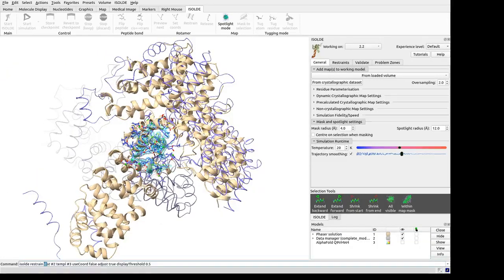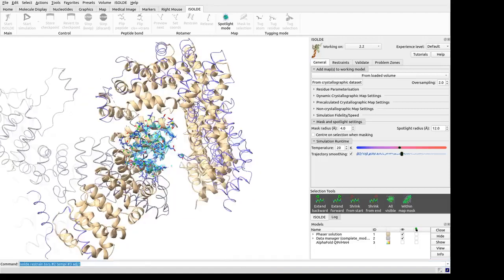In a similar manner, we then add restraints to all phi, psi, and chi torsions in the model, with strength and fuzziness in this case dictated by the pLDDT values for each residue. Residues with pLDDT less than 50 will not be restrained.